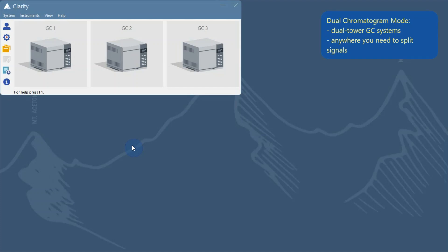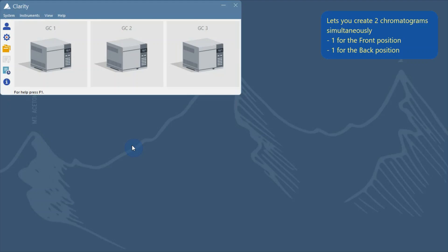This mode is designed for use with Dual Tower GC systems or for any system where you need to split signals from multiple detectors into two separate chromatograms. When enabled, the Dual Chromatogram mode lets you acquire two chromatograms simultaneously, one for the front position and one for the back position.